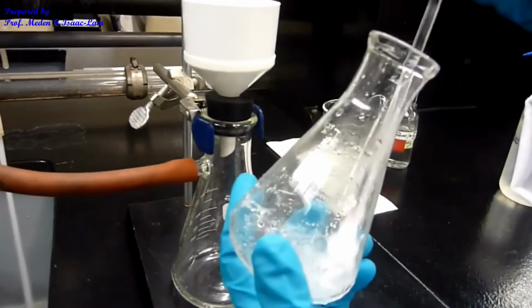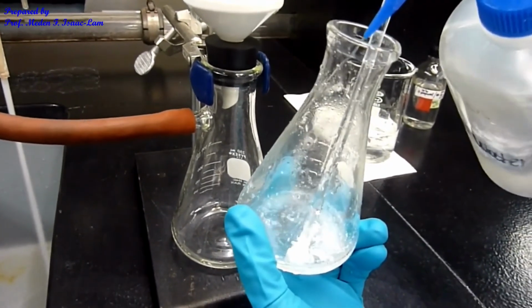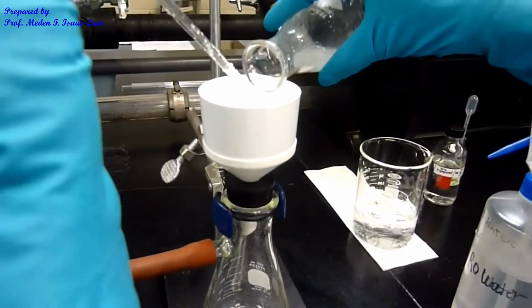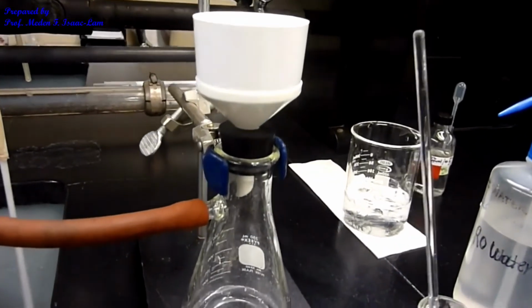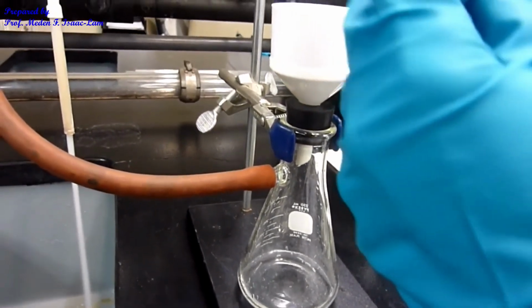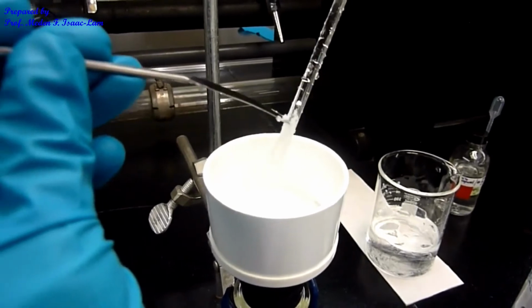So this is now our sample, and I'm just gonna rinse again with ice cold water in the squirt bottle. I'm gonna use this spatula to try to clean out the sticky precipitate.